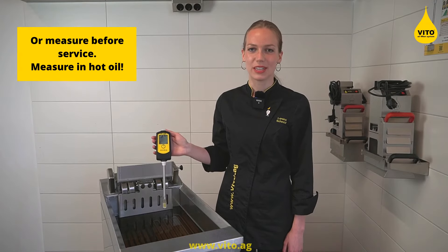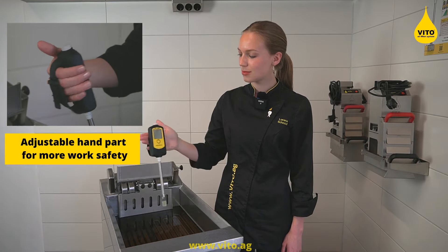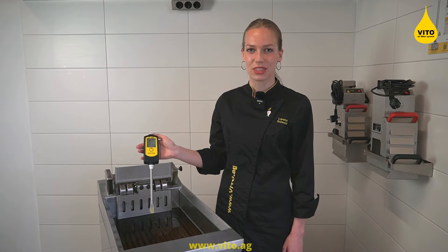Wait approximately 20 minutes before measuring after service. Please make sure to place the device right in the middle of the deep fryer.